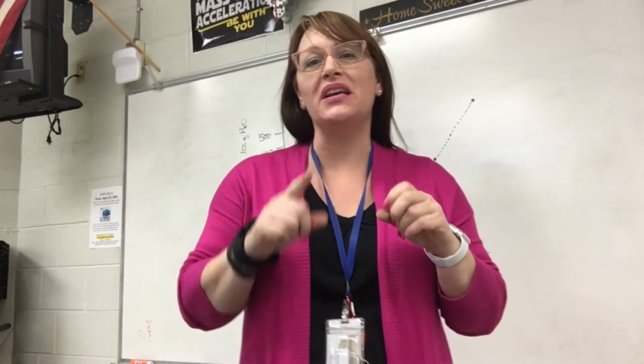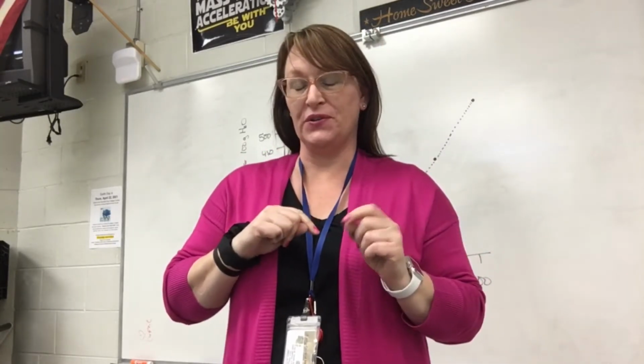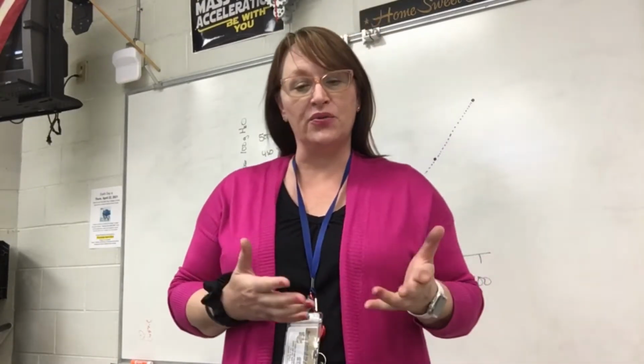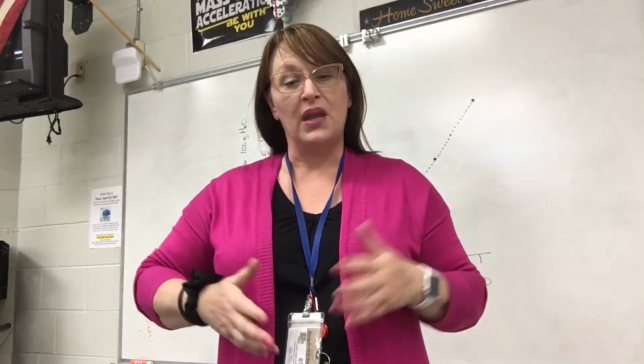We are going to be investigating the solubility of sugar at different temperatures. And we're going to make an aqueous sugar water solution. Now the sugar molecule is actually sucrose, and the chemical formula for that is C12H22O11. So it's a pretty big, covalently bonded molecule.